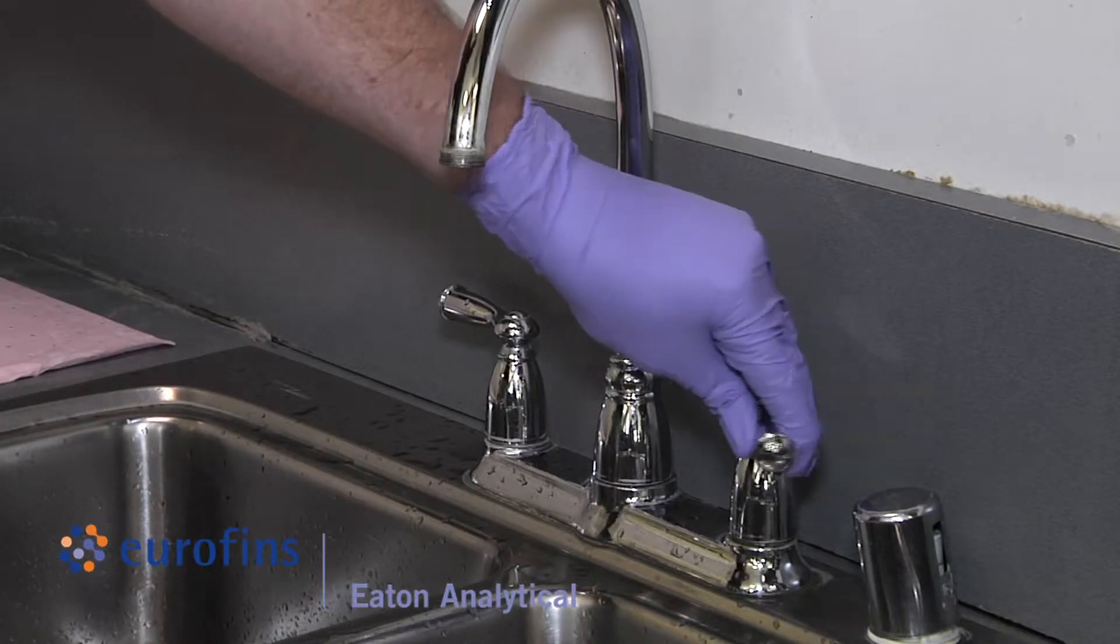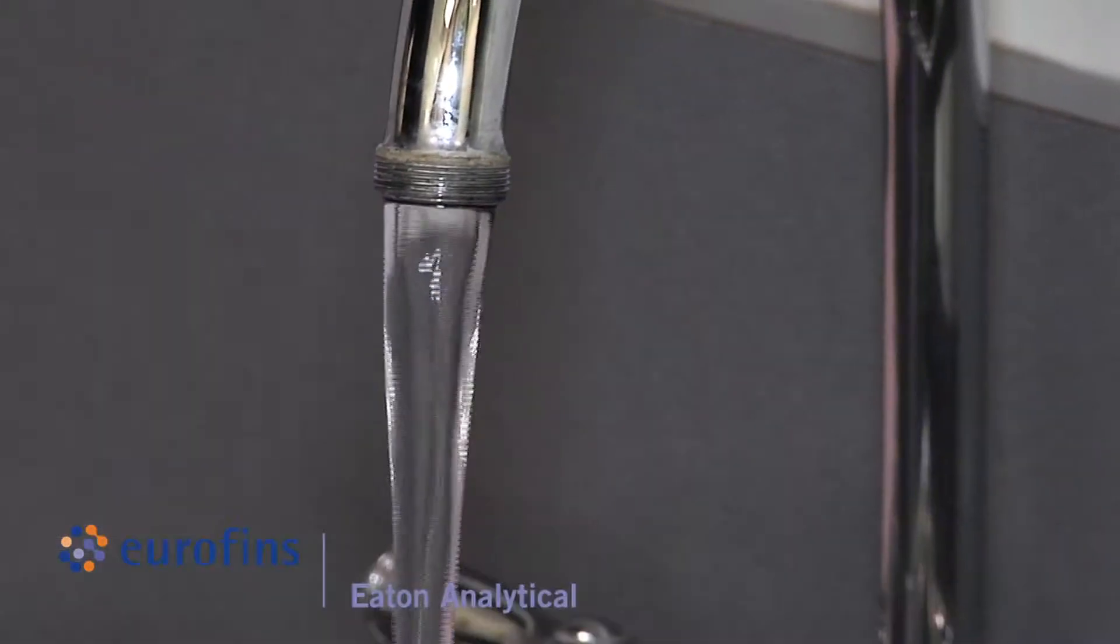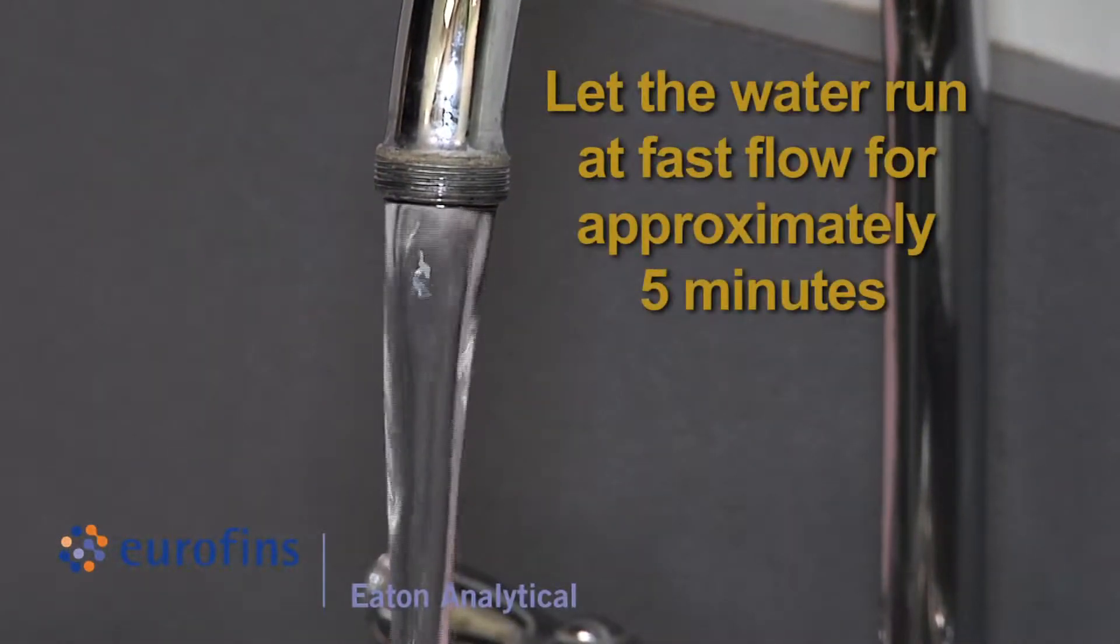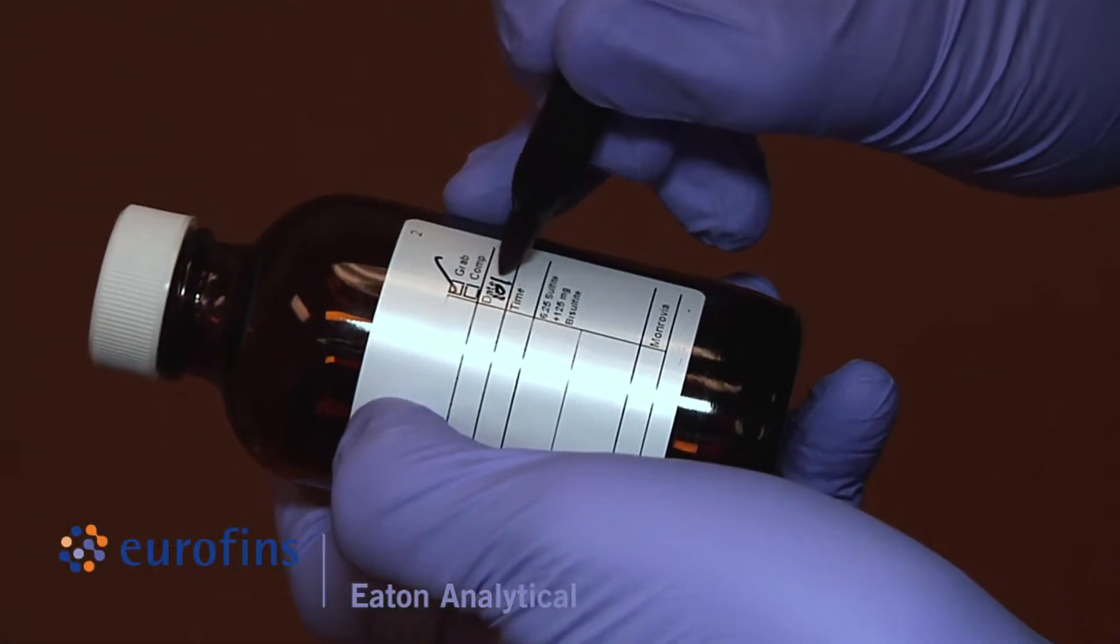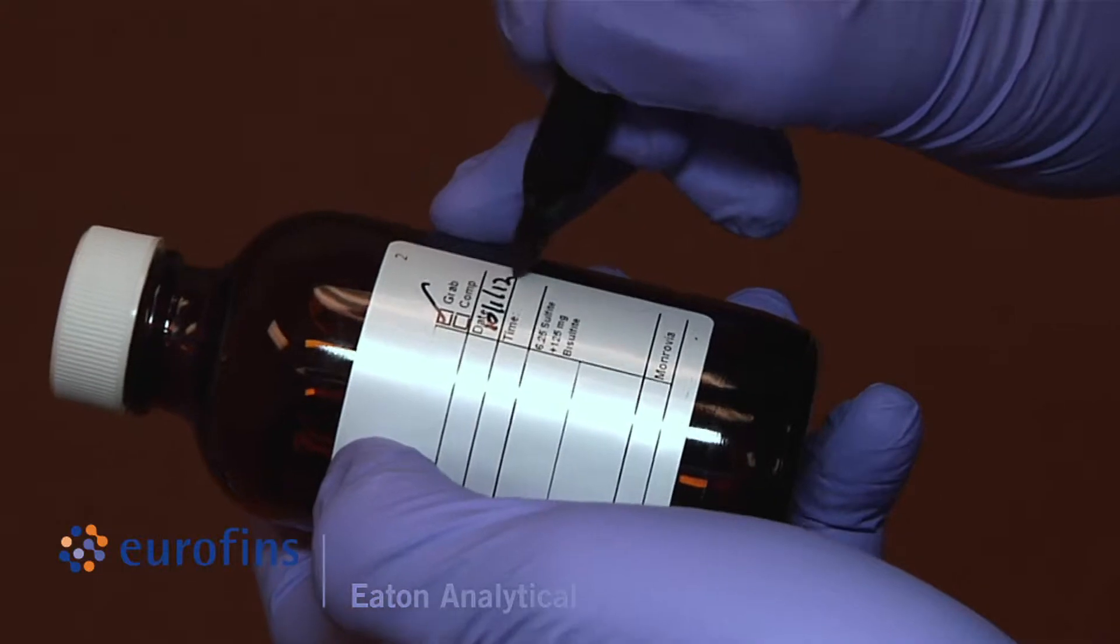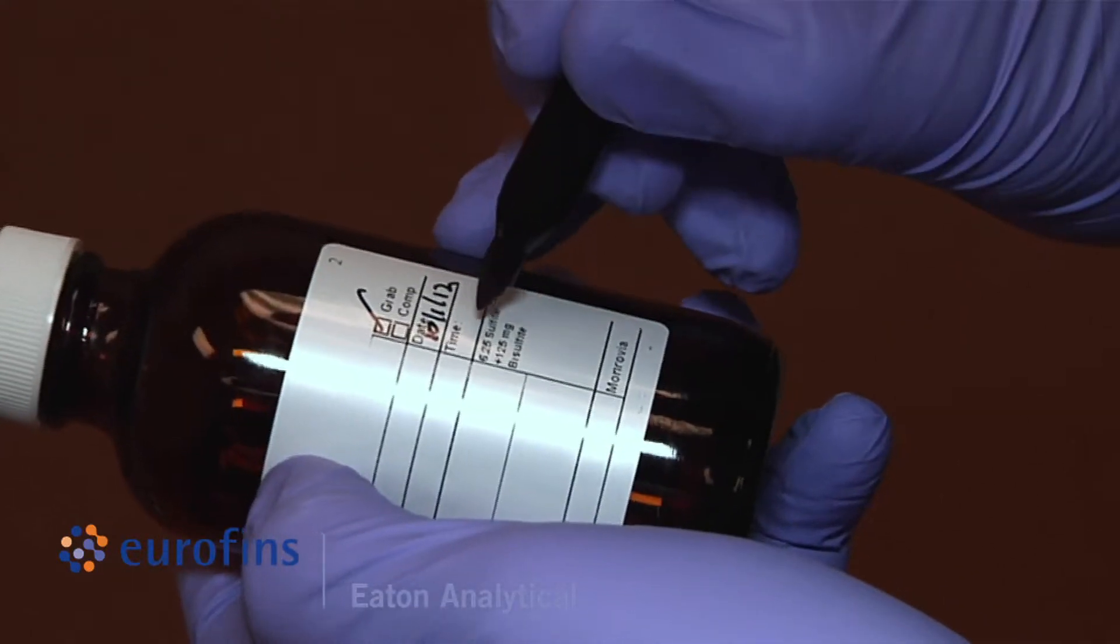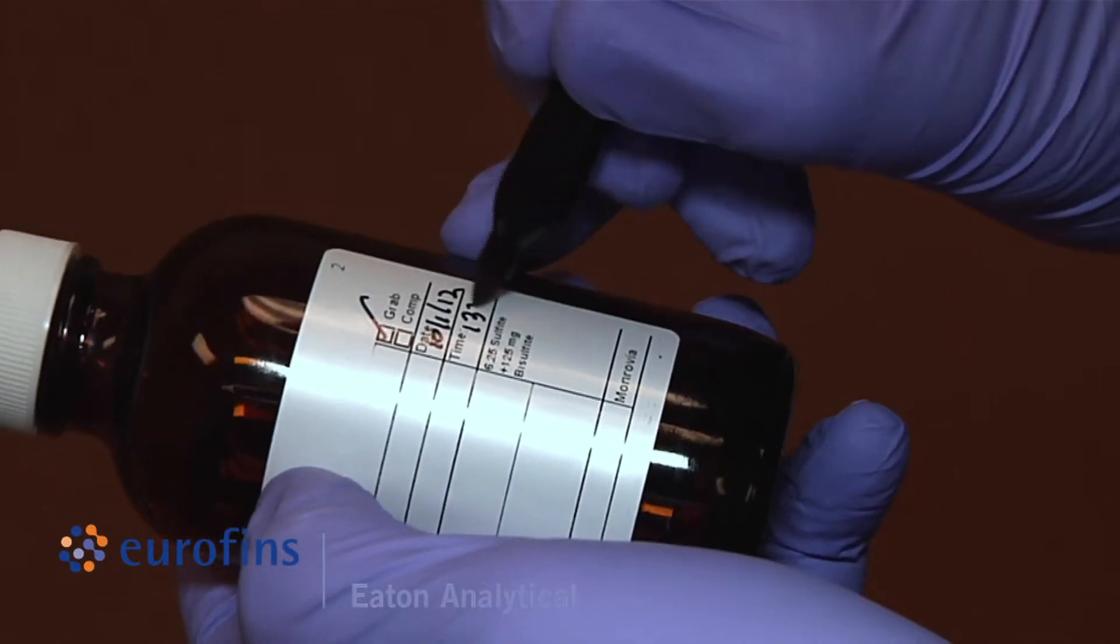Open the tap and let the water run at fast flow for approximately five minutes. Before filling, label bottles with required information that is not already pre-printed such as the sample ID, date, and time of collection.